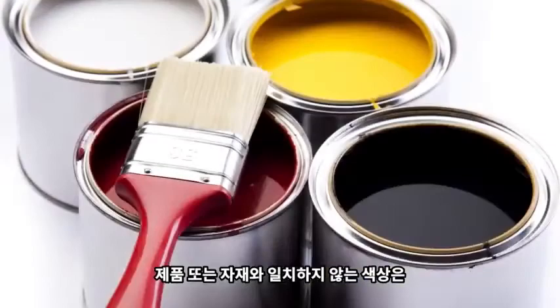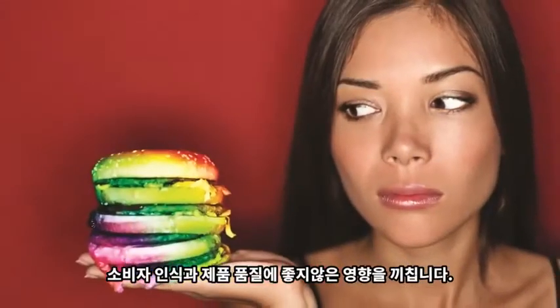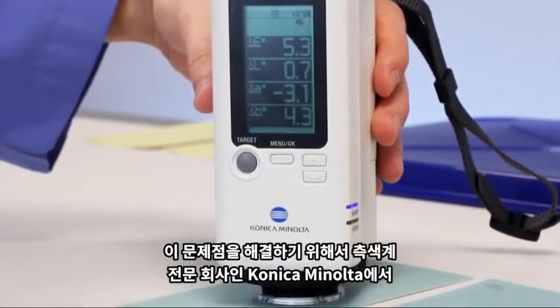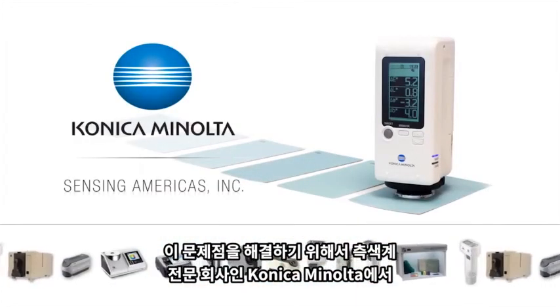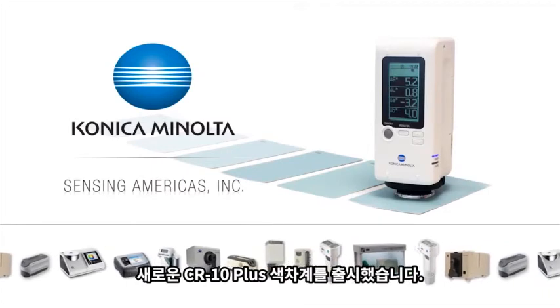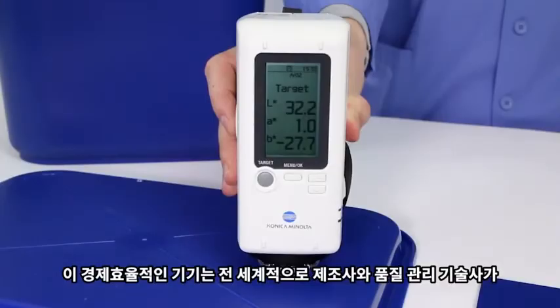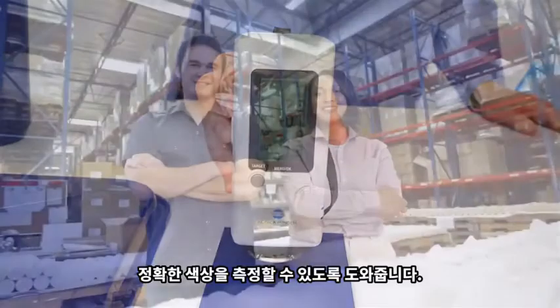Products and materials with inconsistent color negatively affect consumer perception and product quality. To meet this challenge, Konica Minolta Sensing, the leading manufacturer of color measurement instruments, offers the new CR10 Plus Color Reader. This cost-effective technology helps manufacturers and quality assurance professionals worldwide ensure consistent color.